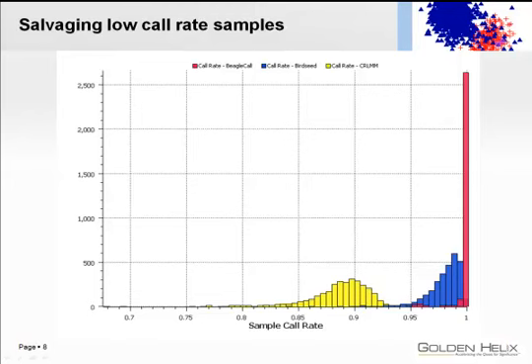It doesn't mean anything. But BEAGLECALL's call rate was extremely high, as well as confident. The call rate was better than 97% for everything that it called. So the nice thing about BEAGLE is that the confidences it reports are very, very close to the actual error rate.